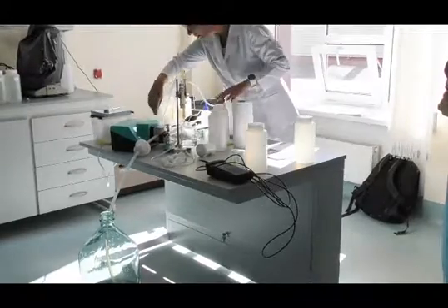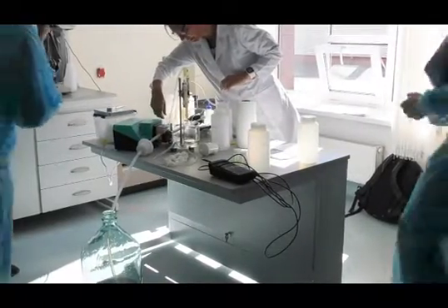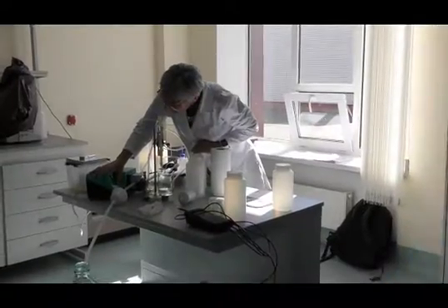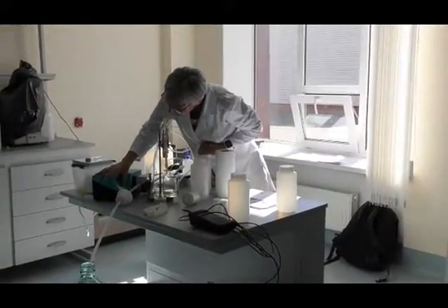Oh no! Something happened. These tube lines, I think we should close this. And I think the speed was a little bit high.